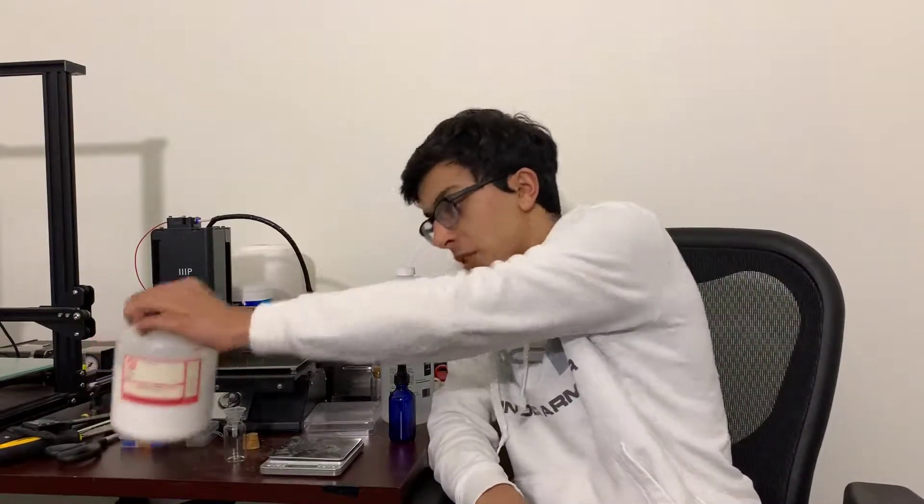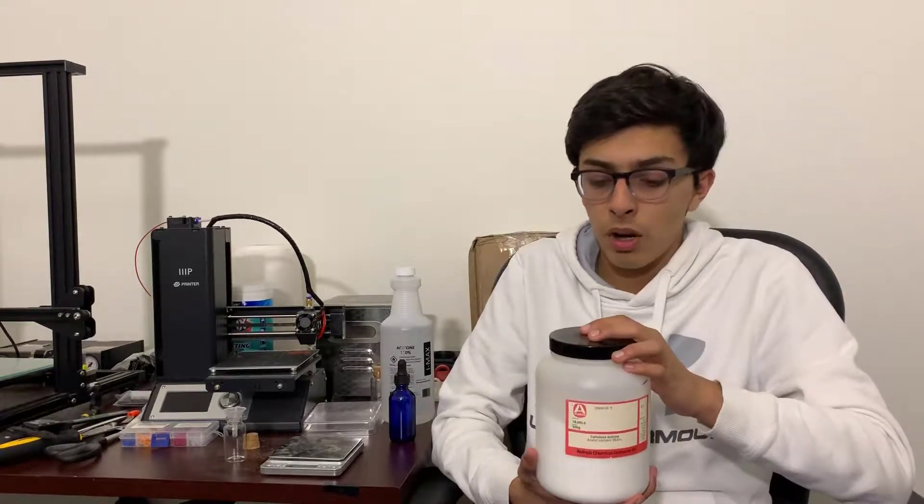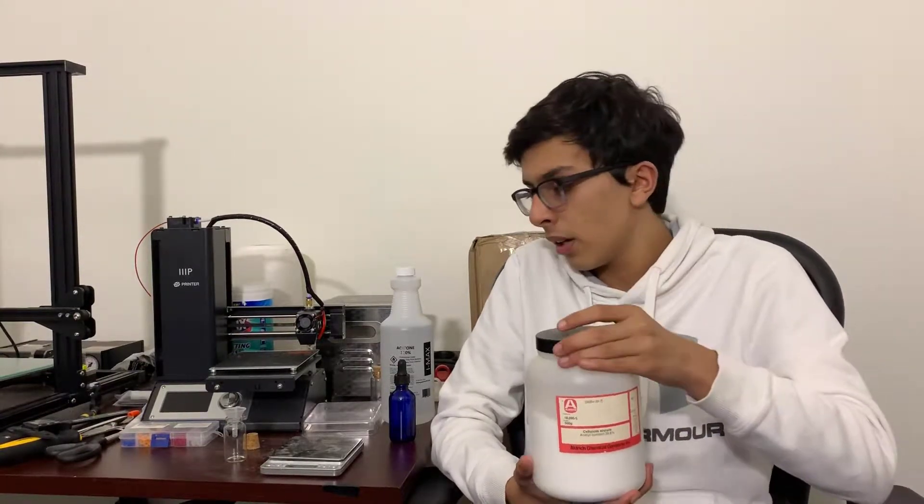What we're going to be creating in this video is a cellulose acetate solution. The components you'll need for that are cellulose acetate. I bought 500 grams of this from Sigma Aldrich and you should be able to do the same as well.